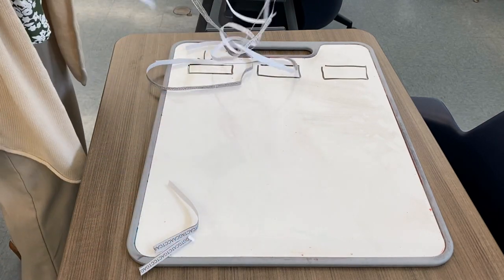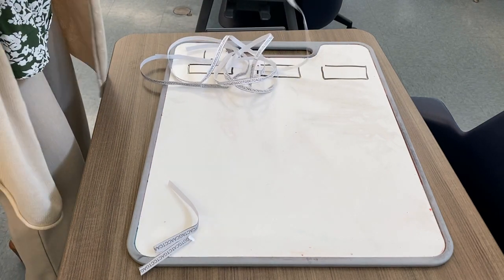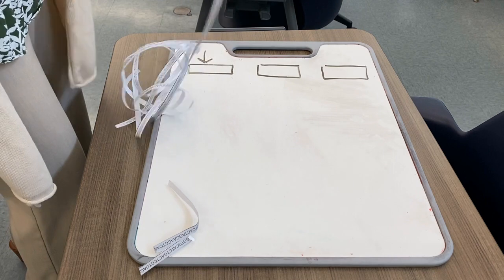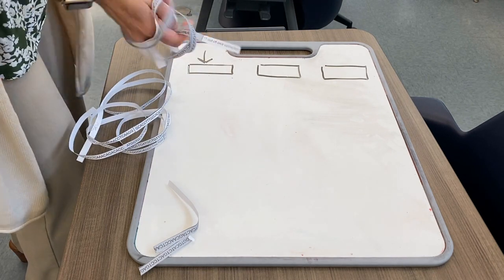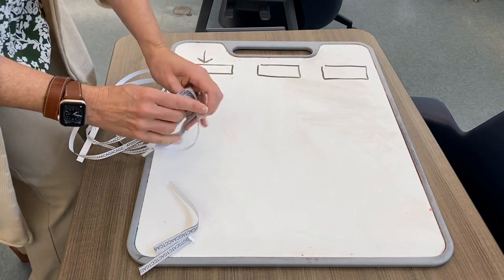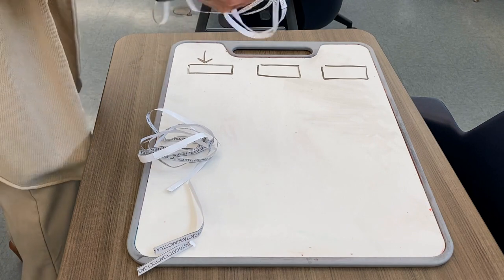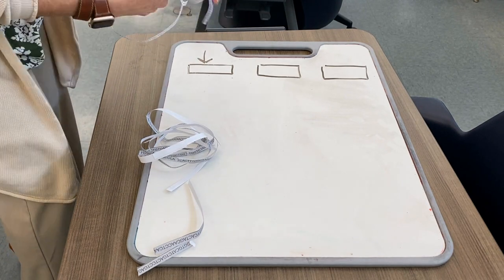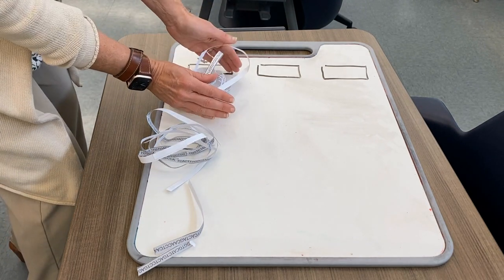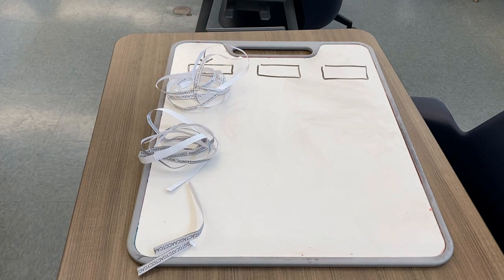Then you're going to want to find the second largest, or the second smallest, and that one will travel not nearly as far as the little short guy, but it will travel across the gel further than the one that was never cut. So here you have the smallest, the second smallest, and then the normal gene that never got cut. That is a lot of DNA. It won't travel very far at all.